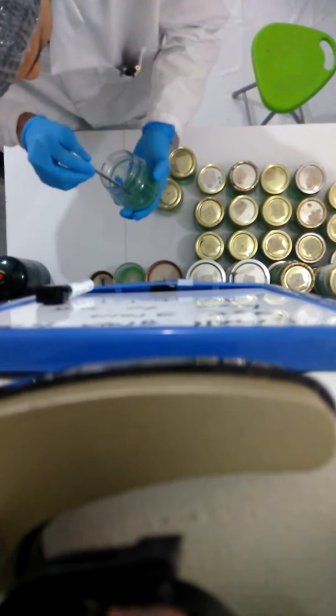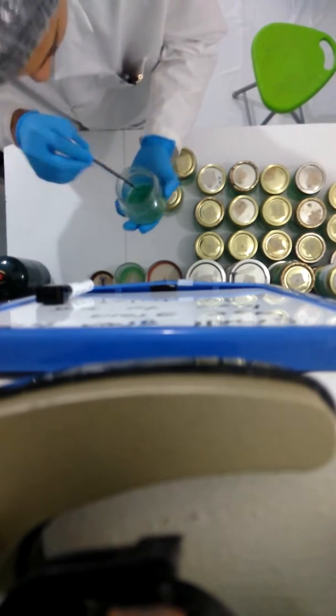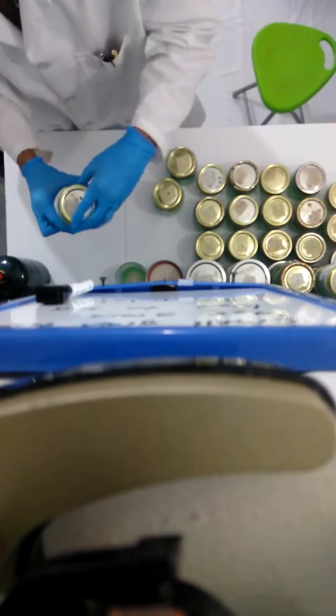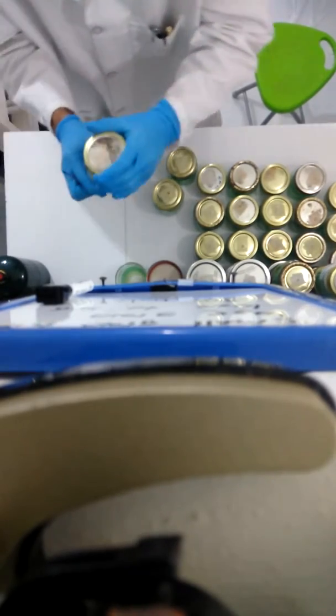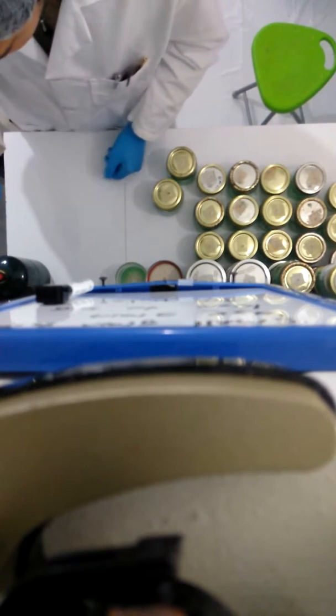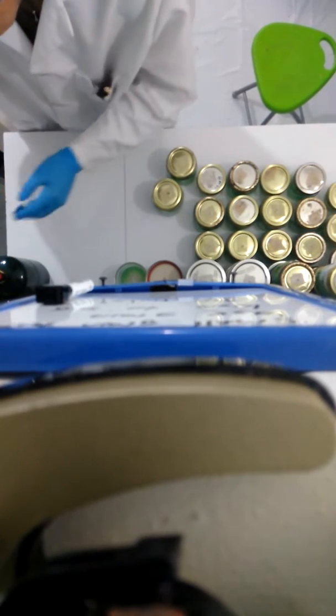That's not generally how I like to do that. I'm using jars right now, as you can see. I used to use petri dishes. I don't really like the jars too much. I'll go back to using petri dishes here shortly.